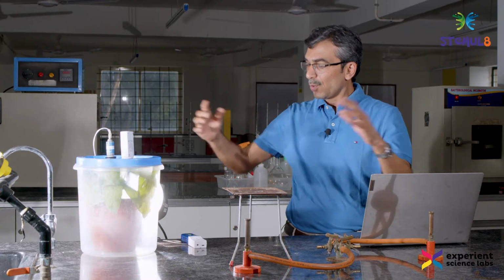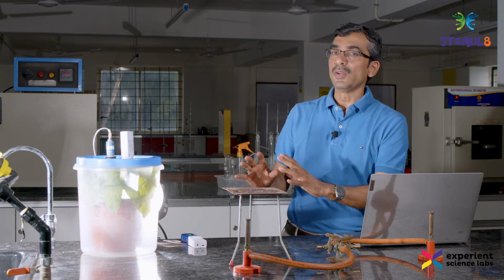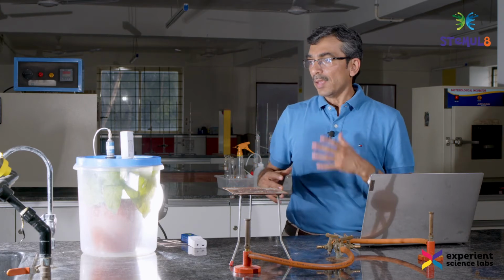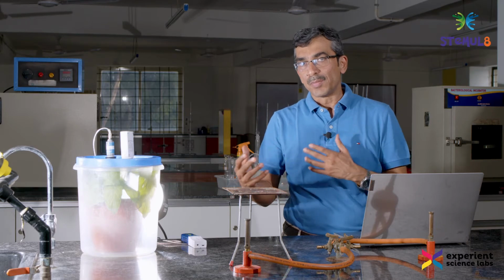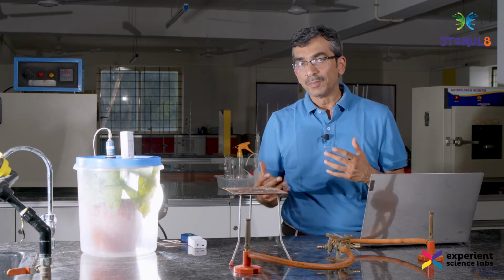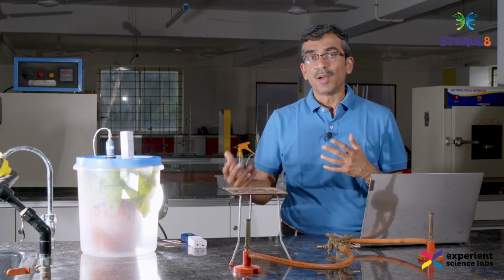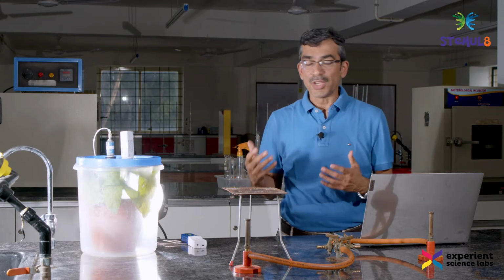And if you look at the setup, you can make out that we have put a lot of studio lights focusing on the plant to simulate the process of photosynthesis. The intent of this exercise is to show the rate at which the photosynthesis goes on, whether it gets impacted by light, and what the plant does with respect to the gases, and how the constitution of the gases changes.